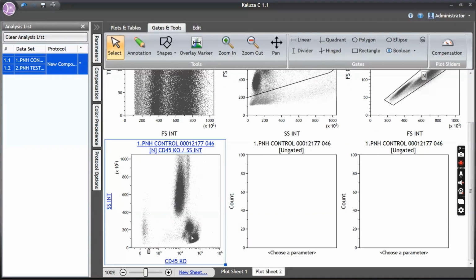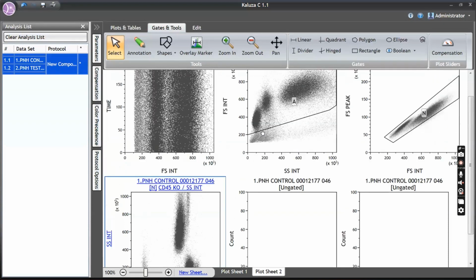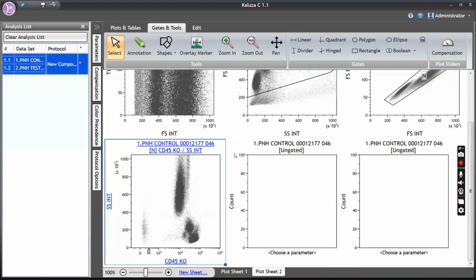So you are finding the neutrophil, monocyte, lymphocyte, monocyte, and neutrophil populations. What is this population? Debris or... Debris will not show so much CD45. Debris you have eliminated now. The basophil. Perfect. That's the basophil population.